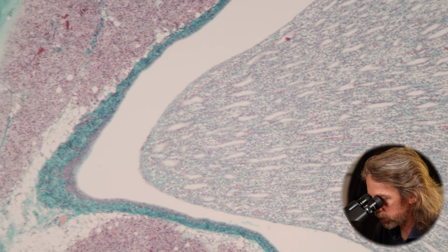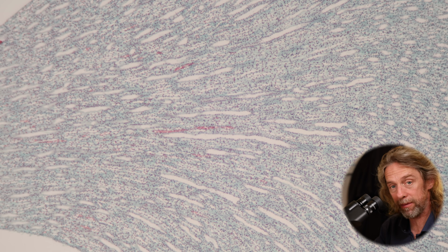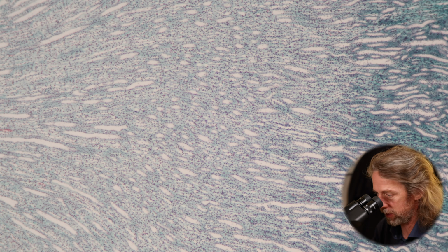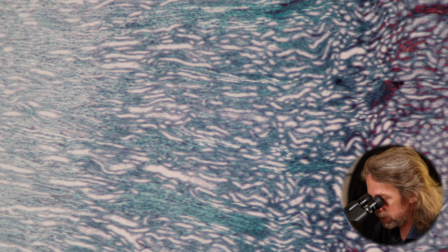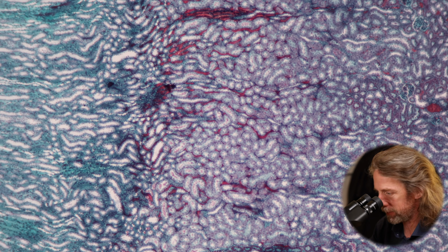So I'll show you the path we just went down. So there are those collecting tubules, these medullary rays. The medullary rays are a mix of collecting tubules, blood vessels, and the renal tubules as they extend down into the medulla. But you can see a clear demarcation, right, where we go from medulla up to the cortex, and look how there are so many more blood vessels further out here. And this is why it keeps catching me out with the brightness, right?